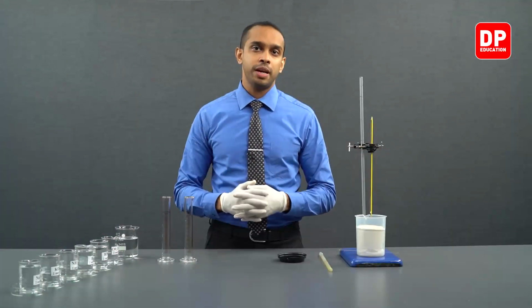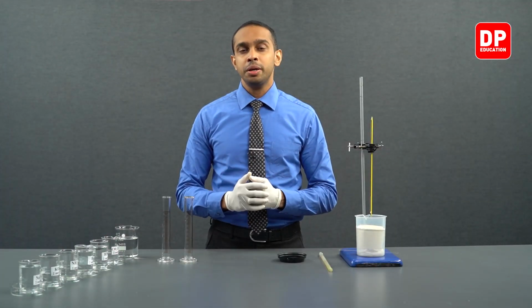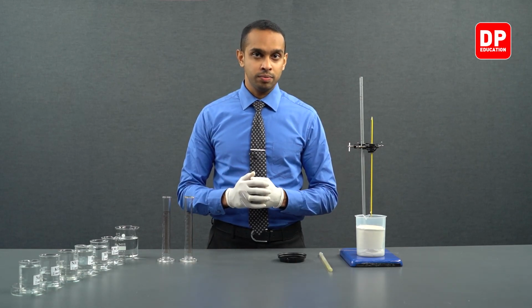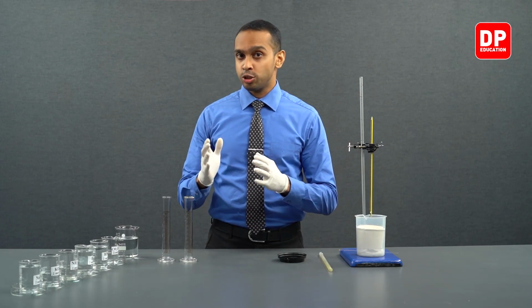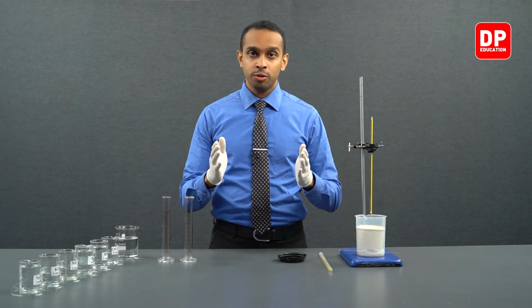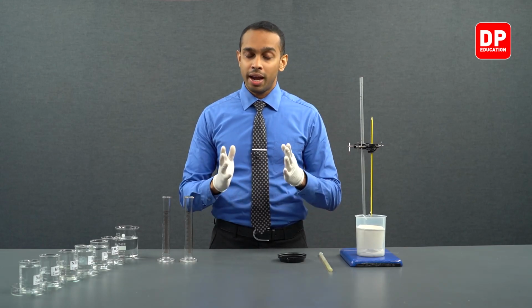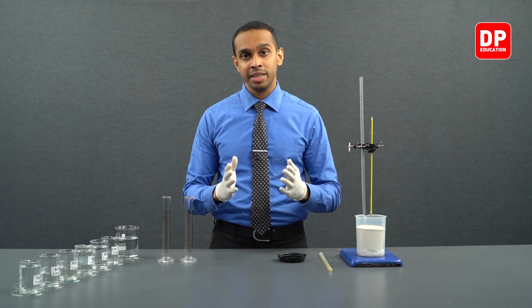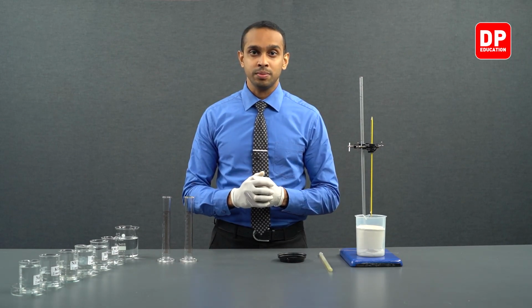In the first part of our experiment, we are going to see a reaction between HCl and sodium hydroxide. HCl is a strong acid and sodium hydroxide is a strong base. Now we are going to see the reaction between a strong acid and a strong base and measure the temperature increase when this reaction is happening.